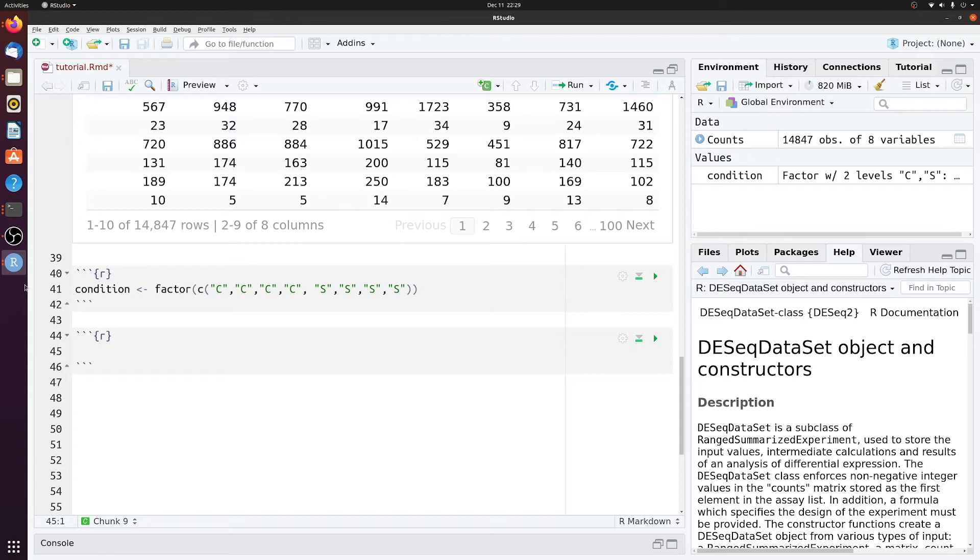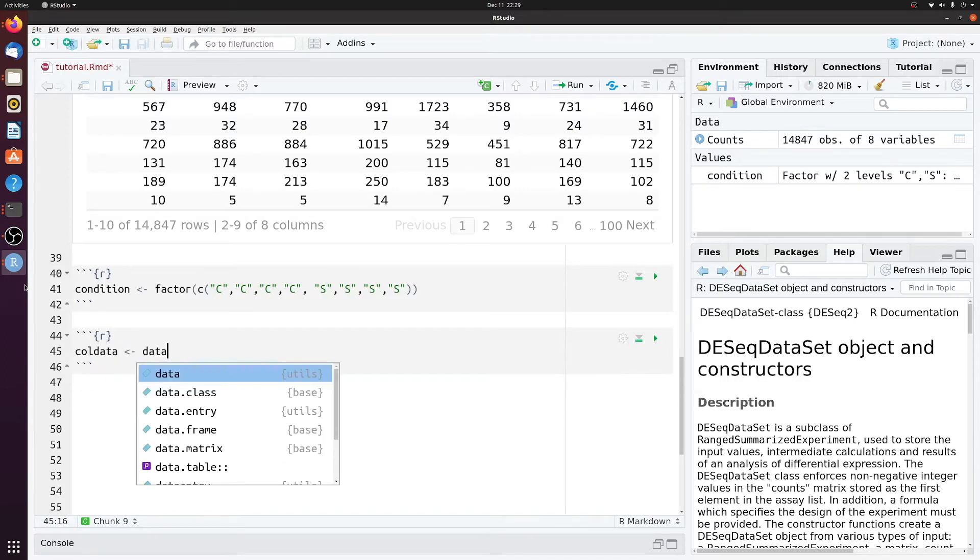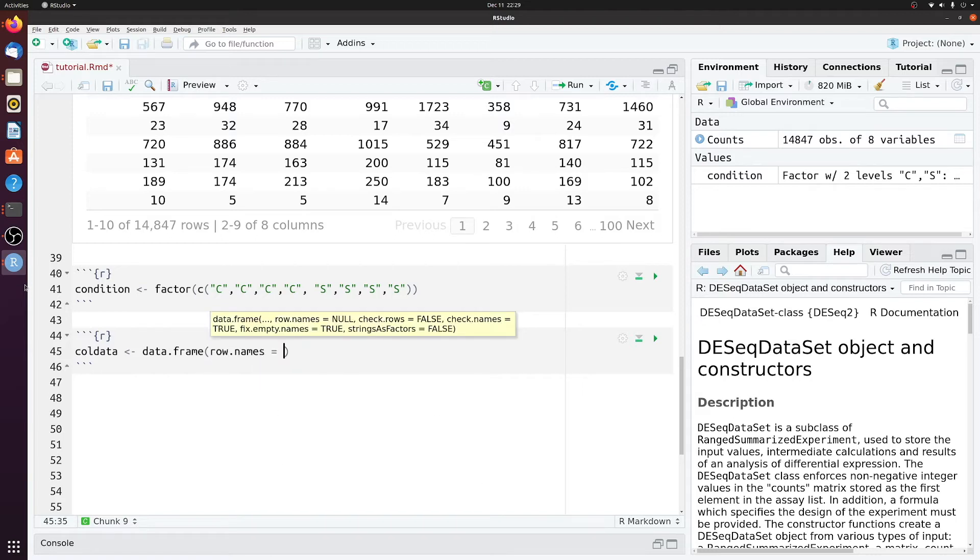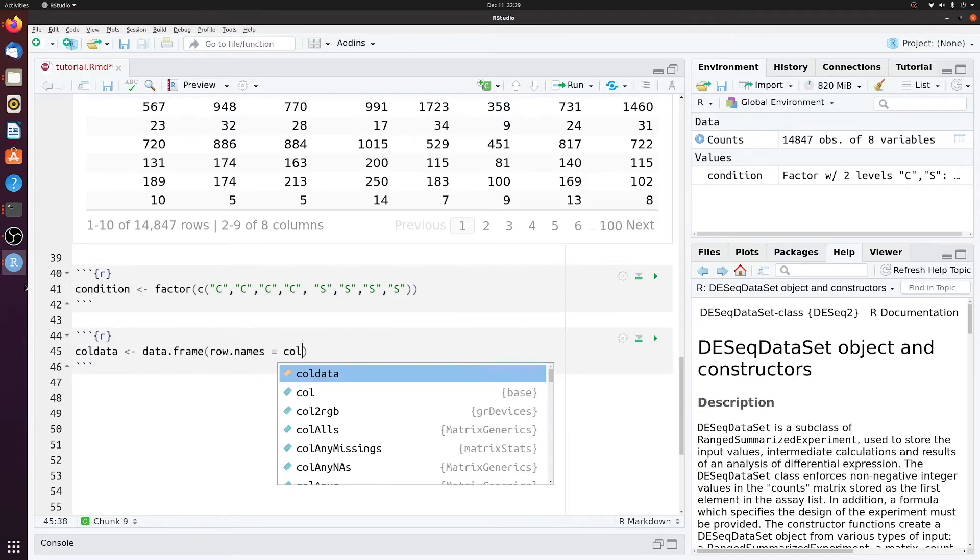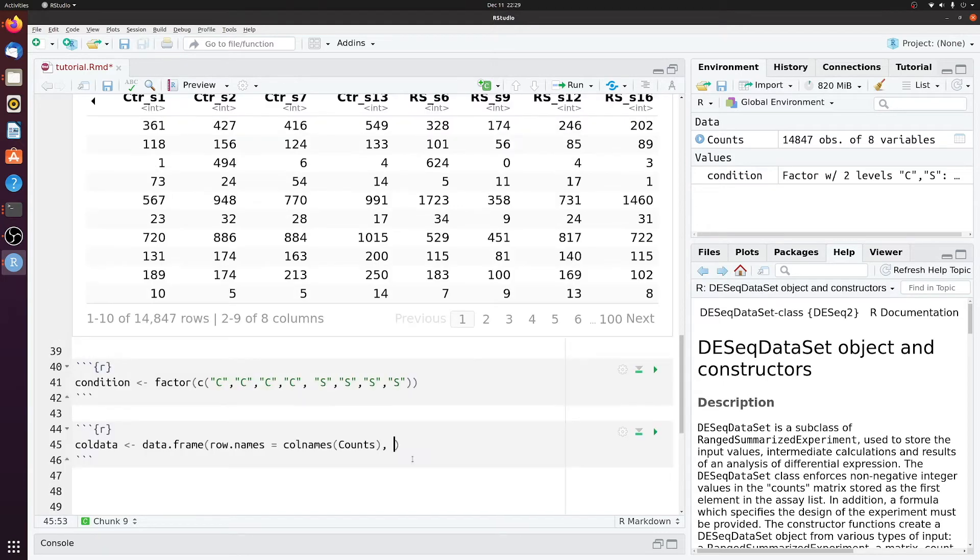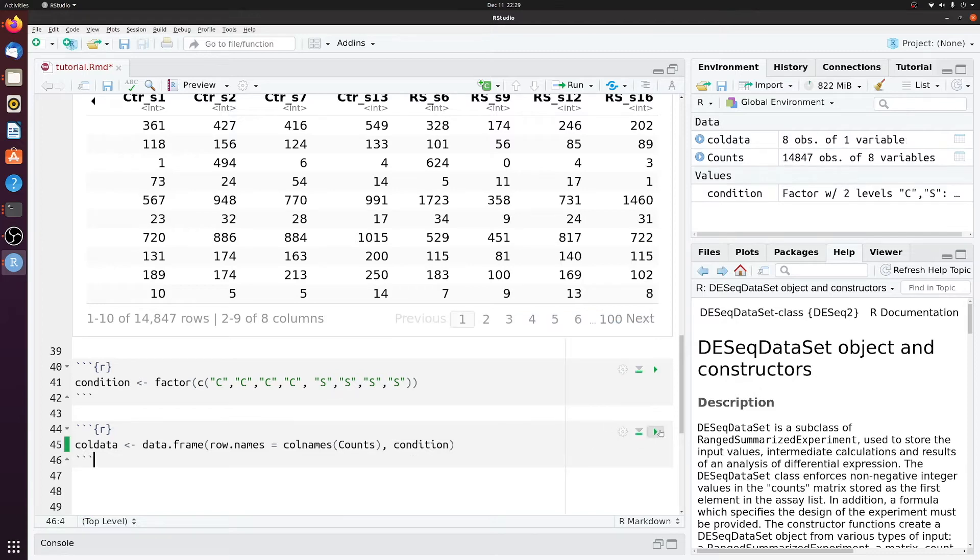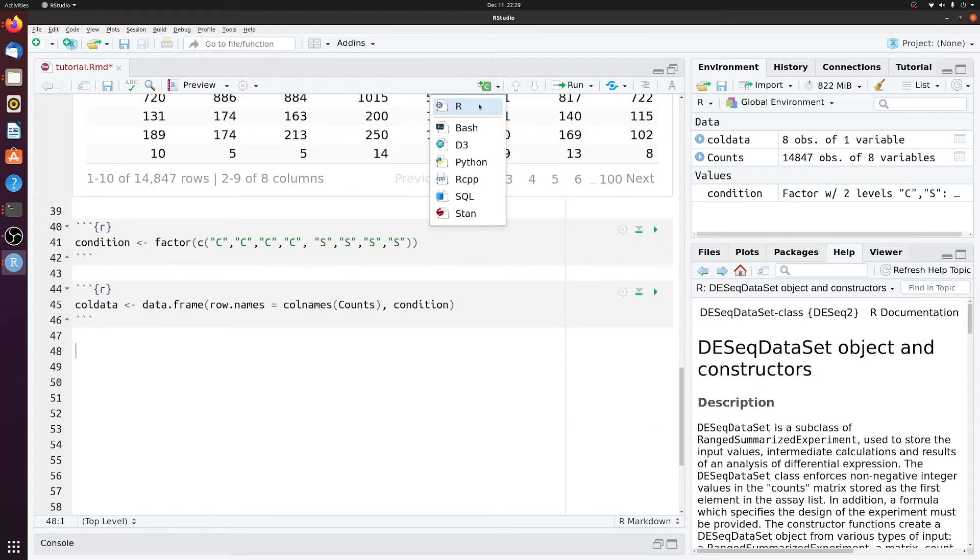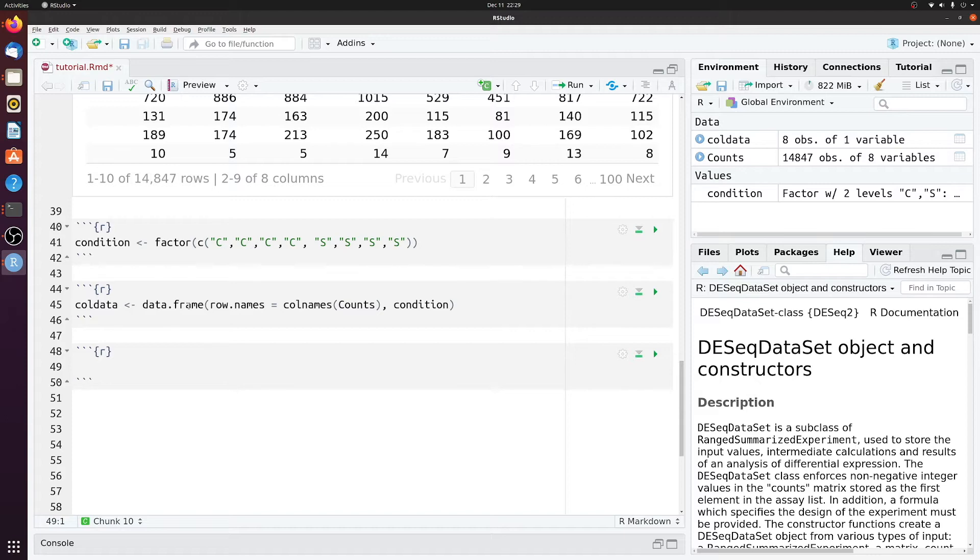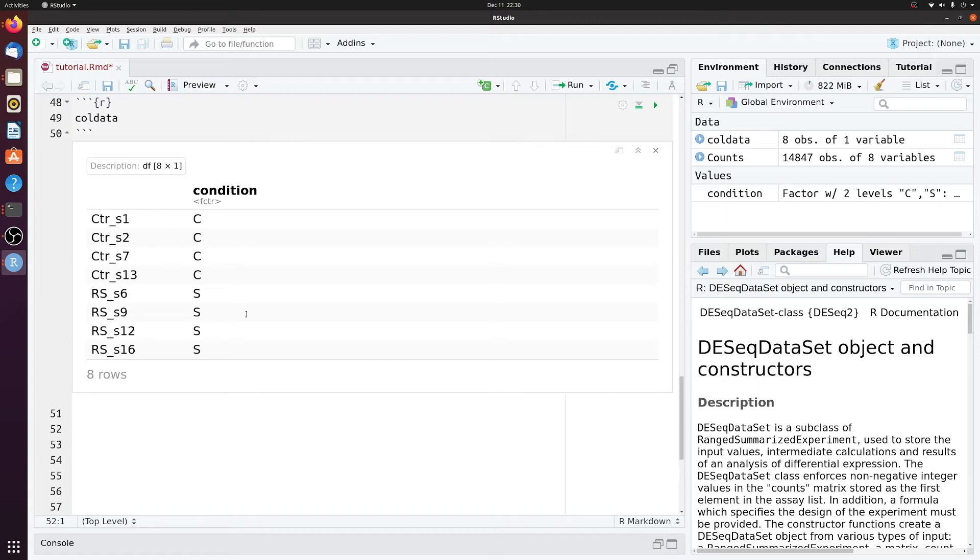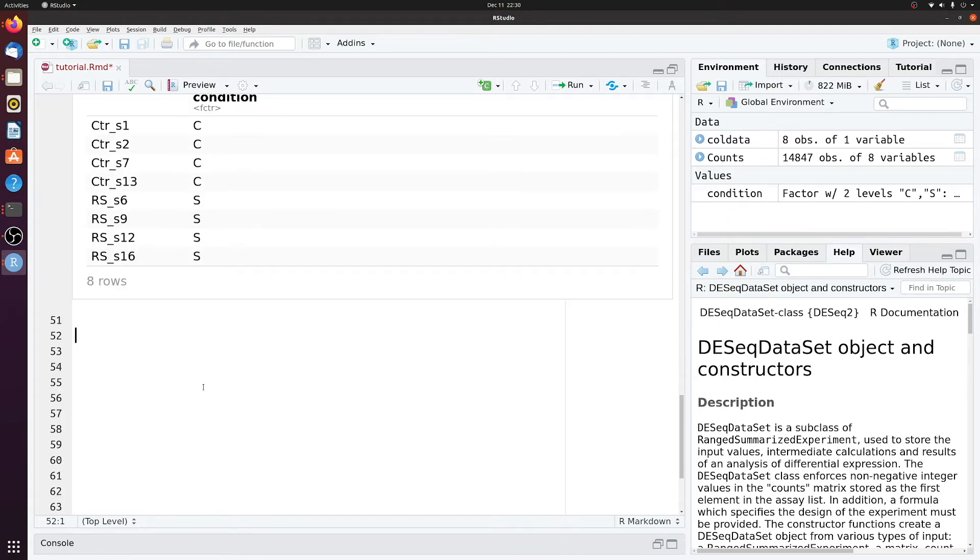And then we'll make a little data frame of these conditions and the samples. So we'll call that colData and then we'll say data frame row names is equal to the column names of counts, condition. So if we look at that colData.